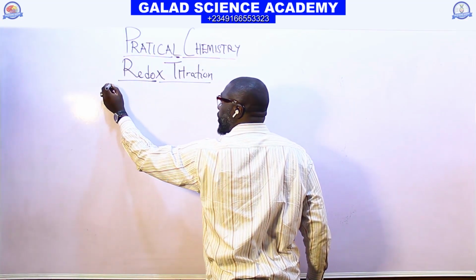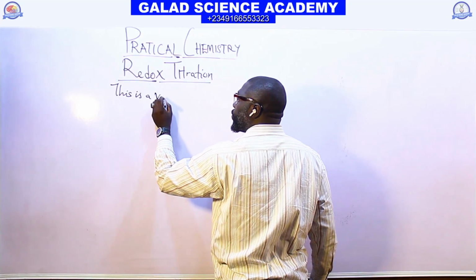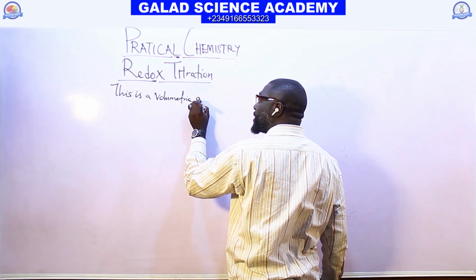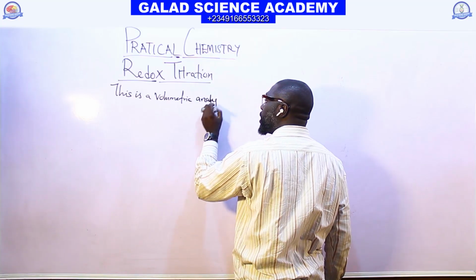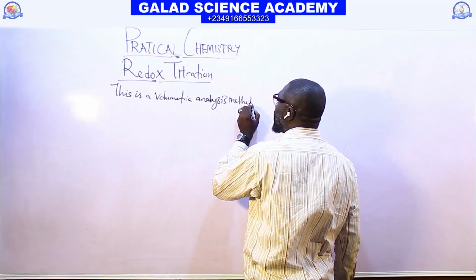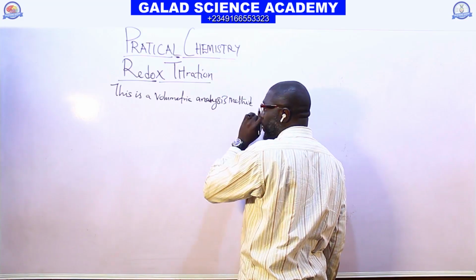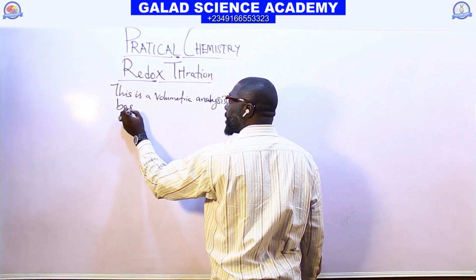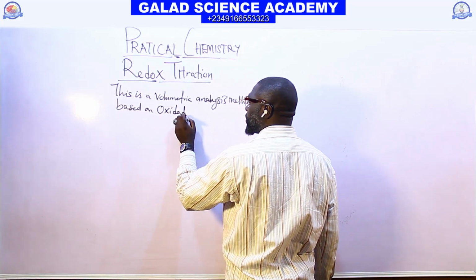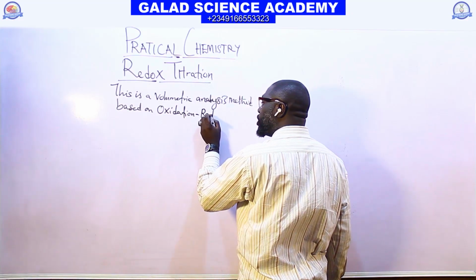This is a volumetric analysis method, or a titration analysis method, based on oxidation and reduction.